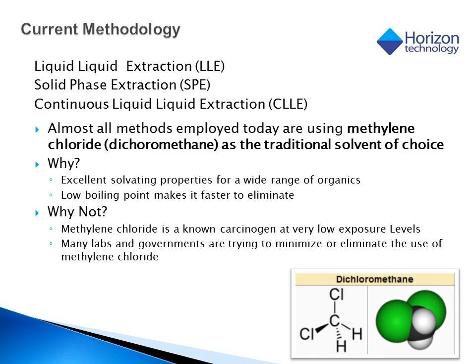All of these technologies have benefits and drawbacks in terms of impact on laboratory safety and also sample throughput. For instance, liquid-liquid extraction is very simple to do, so training is minimal. However, it uses great volumes of solvents, takes time, and is problematic with emulsions commonly occurring. Continuous liquid-liquid extraction is time-intensive and greatly impacts the amount of results a lab will generate in a given time.